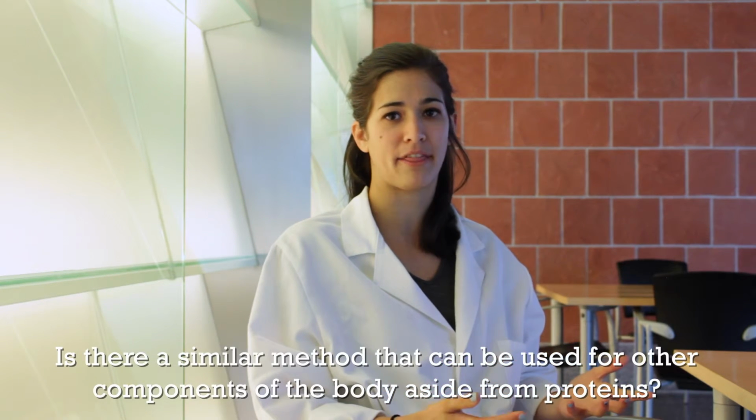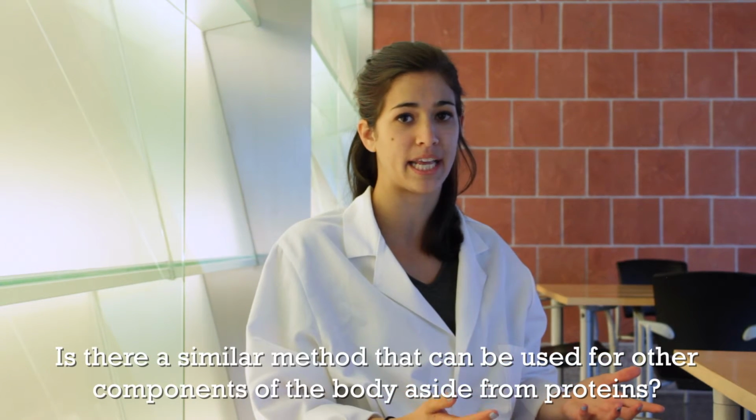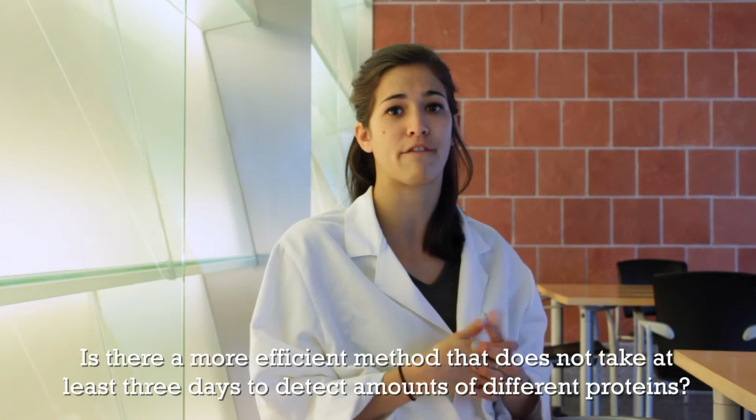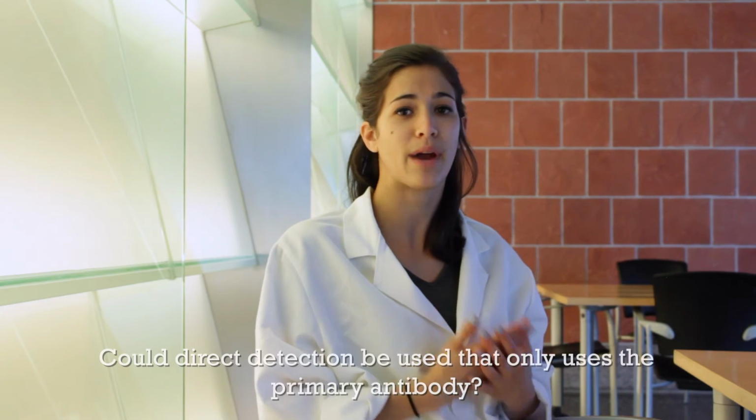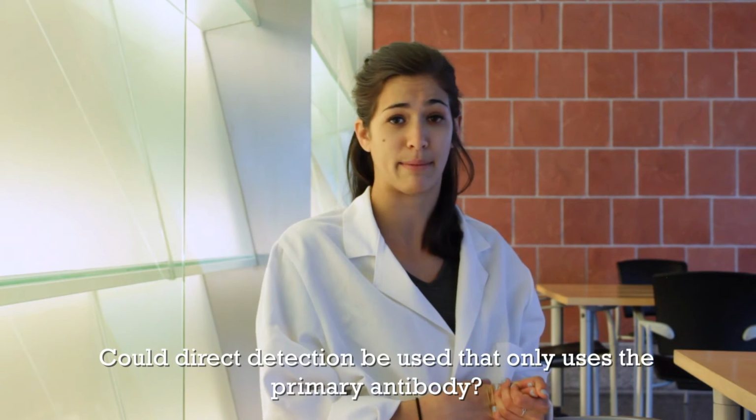As my review of this technique comes to an end, the questions I have now are, is there a similar method that can be used for other components of the body aside from proteins? The other question is, is there a more efficient method that does not take at least 3 days to detect amounts of different proteins? The third, although using a secondary antibody results in a signal amplification, could direct detection be used that only uses primary antibody?